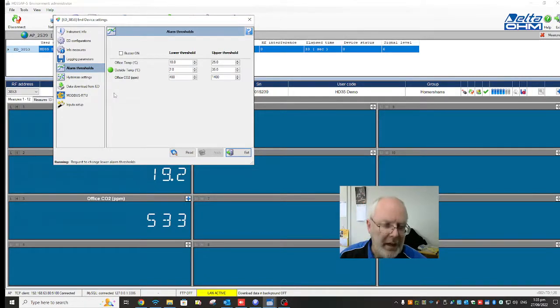I have yet to find out the definition of all alarms, whatever it was you said. I've got to check what that means. I think that may have been lost in translation from Italian, and I'm not seeing it in the help file. Let me know if that answers your questions for now.